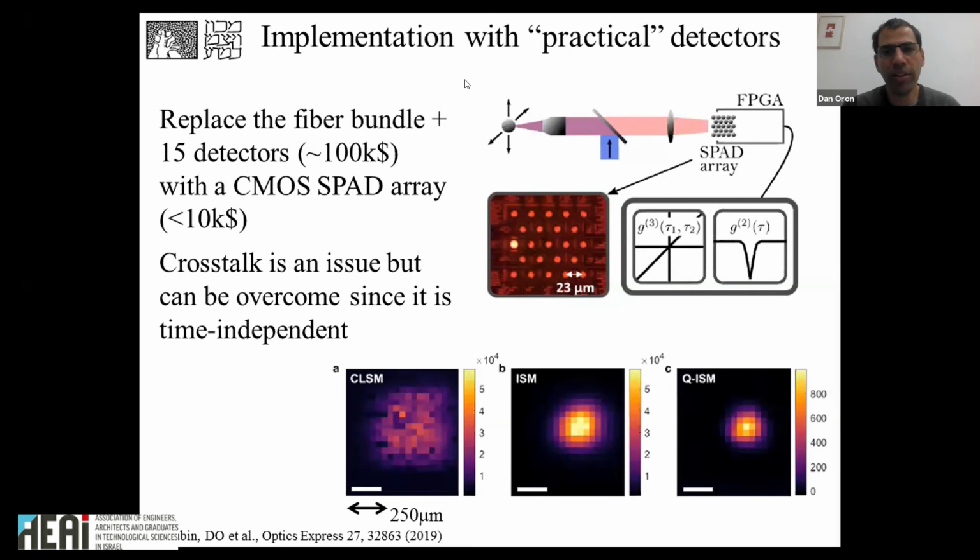Okay, there was a question about non-fluorescent inorganic samples. That's a very good question. Most of biological imaging relies on fluorescence, and as such, most of the tools were developed for fluorescent samples. However, these tools, which are based on something like image scanning microscopy, can be applied also to scattering, but it's a bit more complicated because scattering is a coherent process, so you also have to take into account the phase.